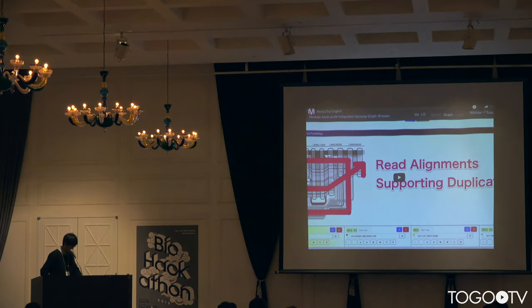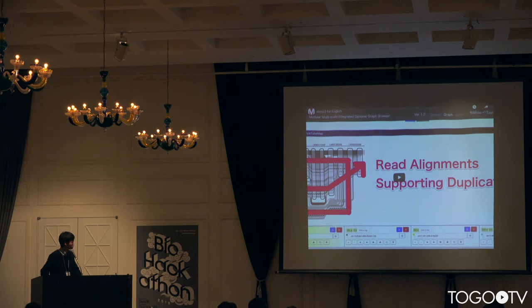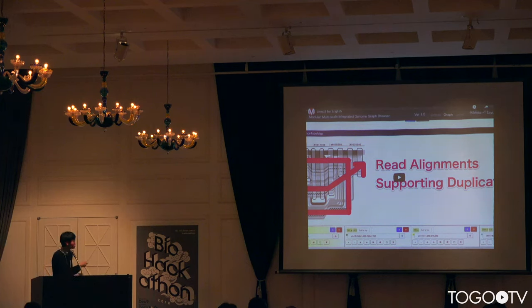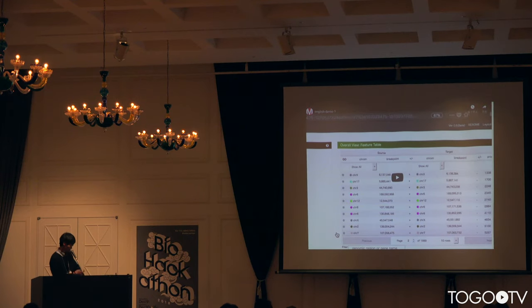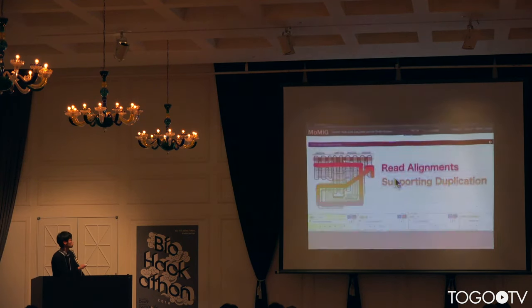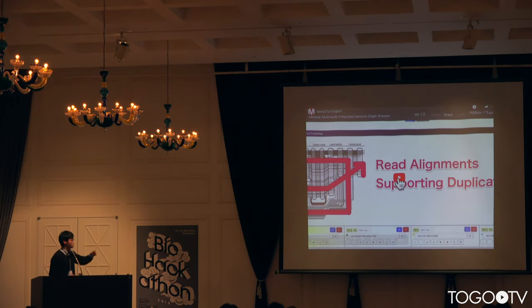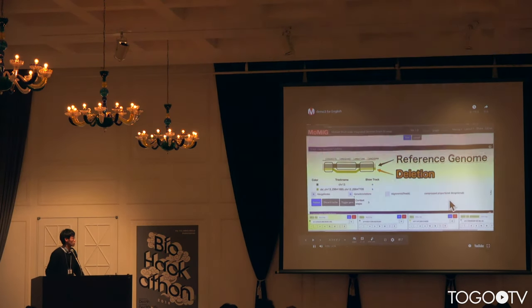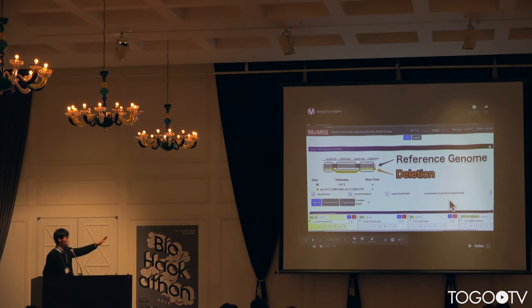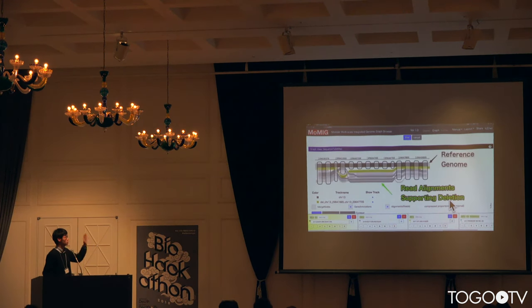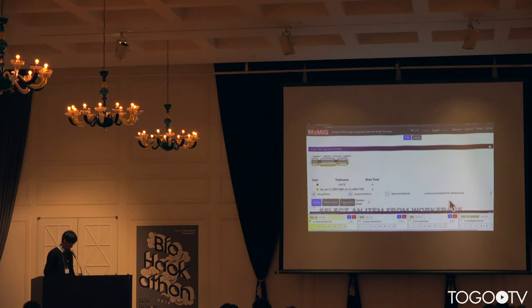We can also validate this variant using read alignments. This deletion is also validated by read alignments, shown as many thin lines.